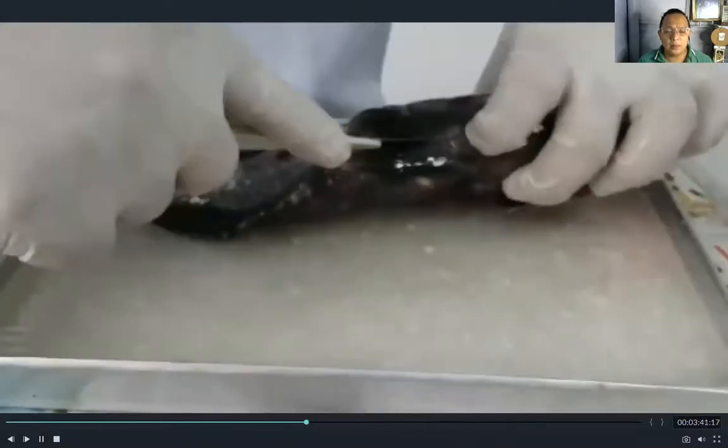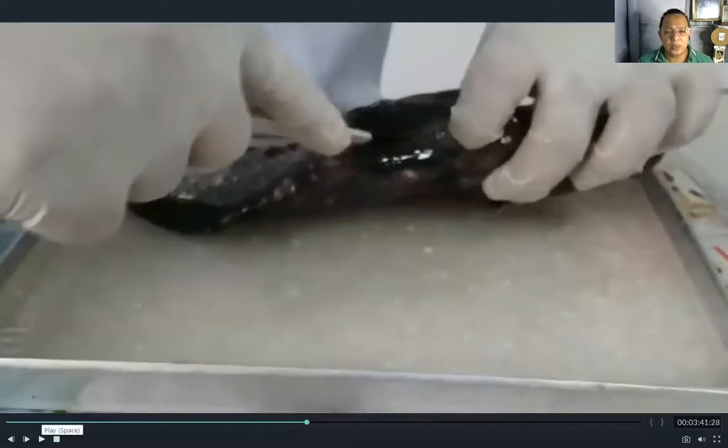A useful technique before dissecting a fish is to put the fish in the freezer for at least 10 minutes first, so that the internal organs freeze and the fish is not as slimy. In this video, a very fresh fish is used, which is why it is quite slimy.